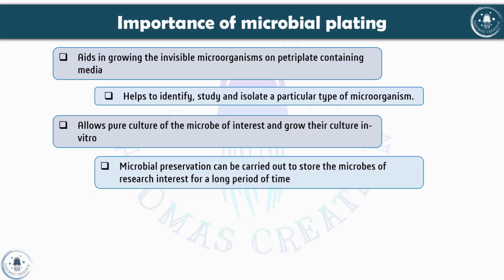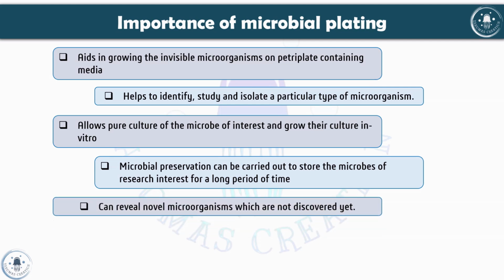Okay, so microbial plating will also help in microbial preservation. Suppose this is an important species that you have discovered and you want to preserve it. So you can also do it. You can do the stock culture and you can submit your species for identification. So that is how this plating will help you to store the microbes of your research interest for a very long period of time.